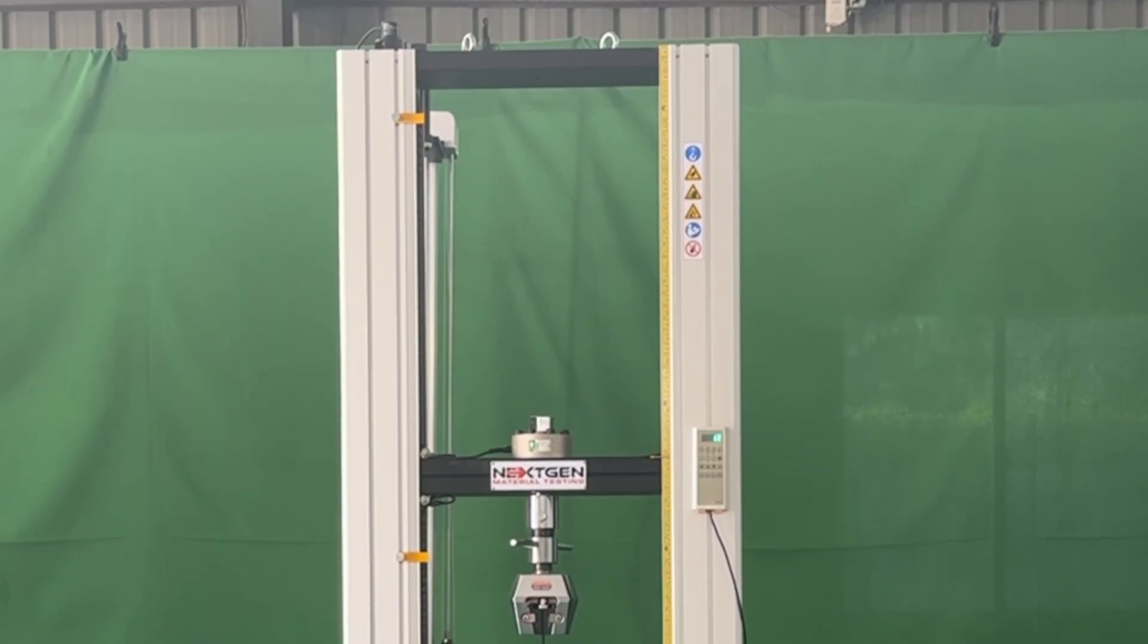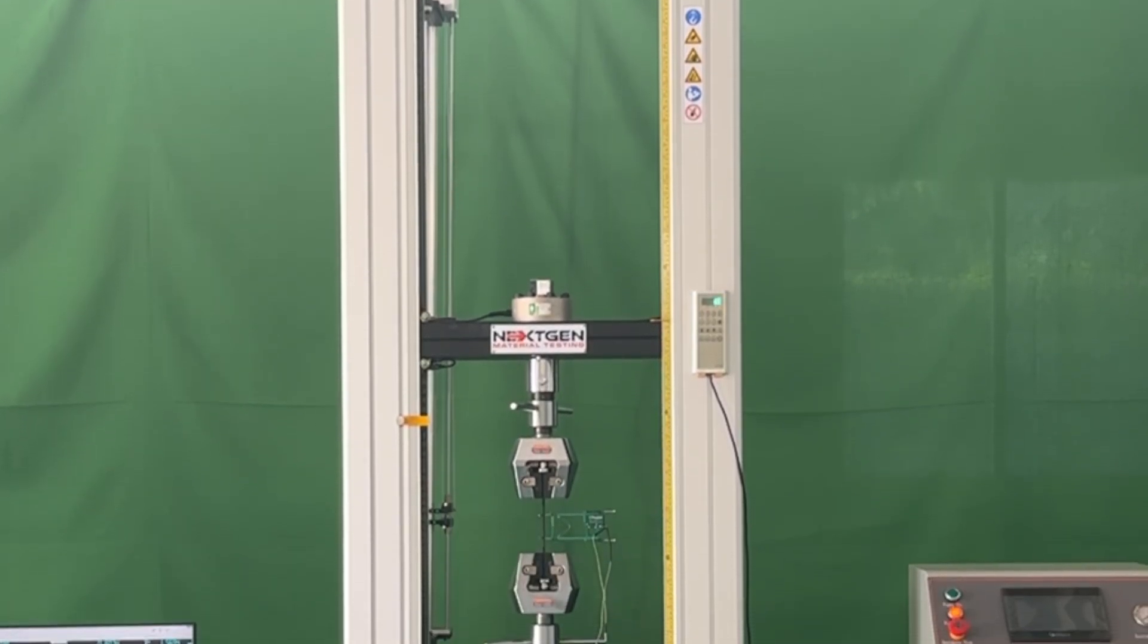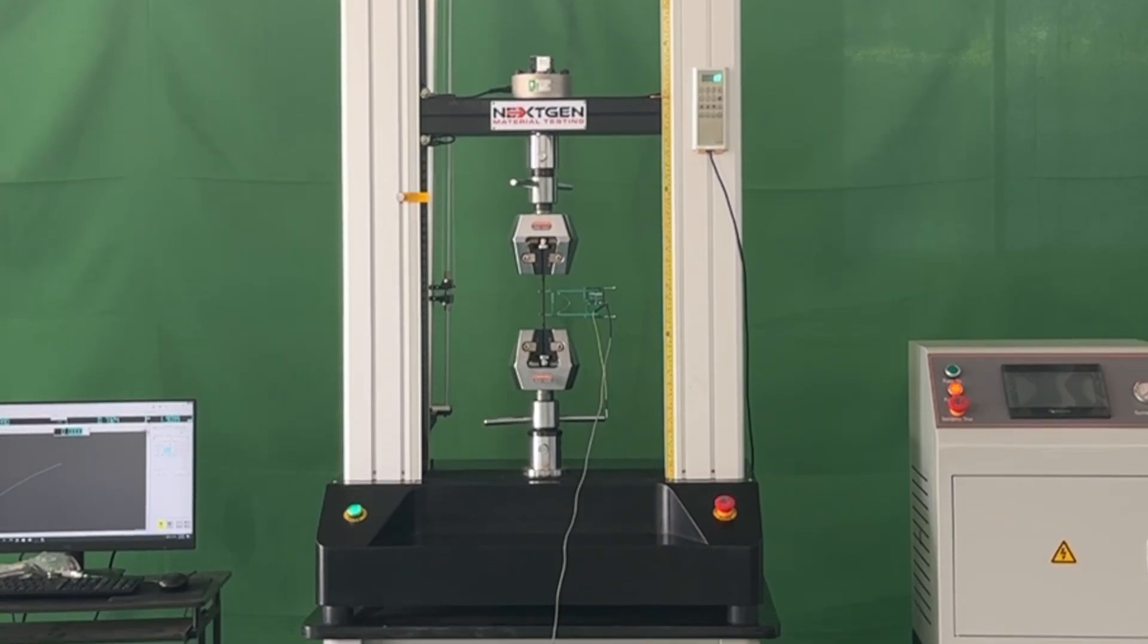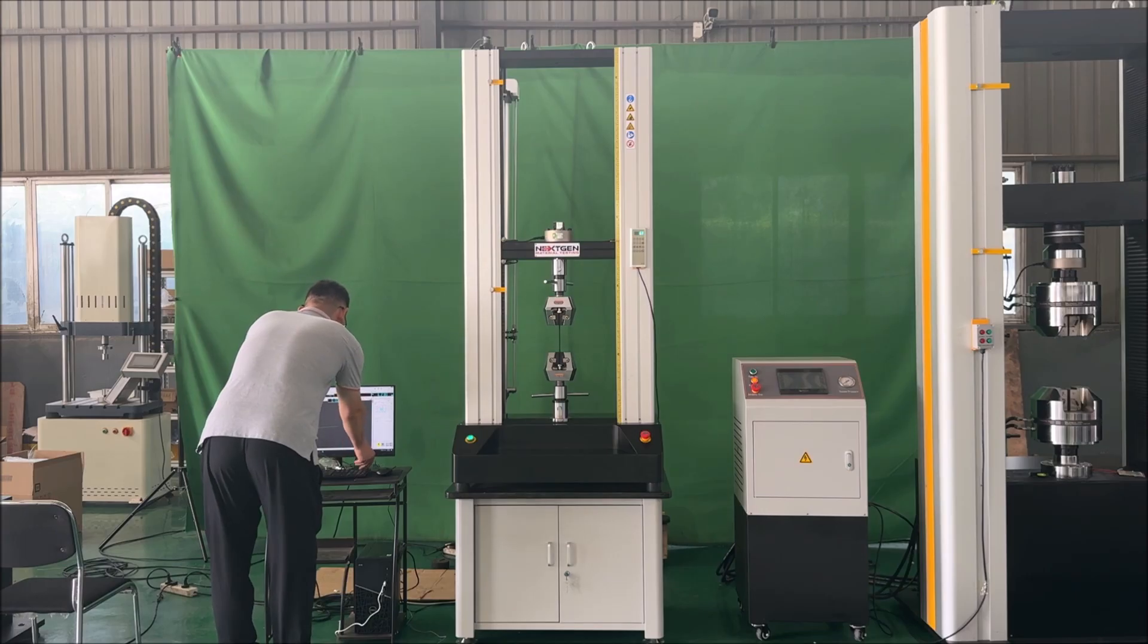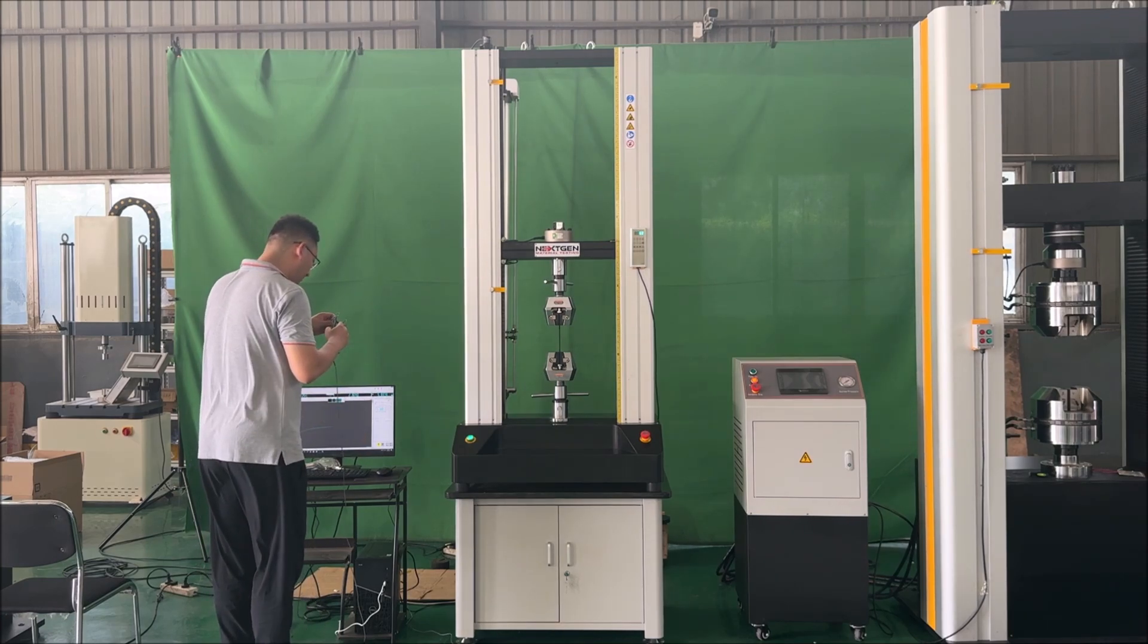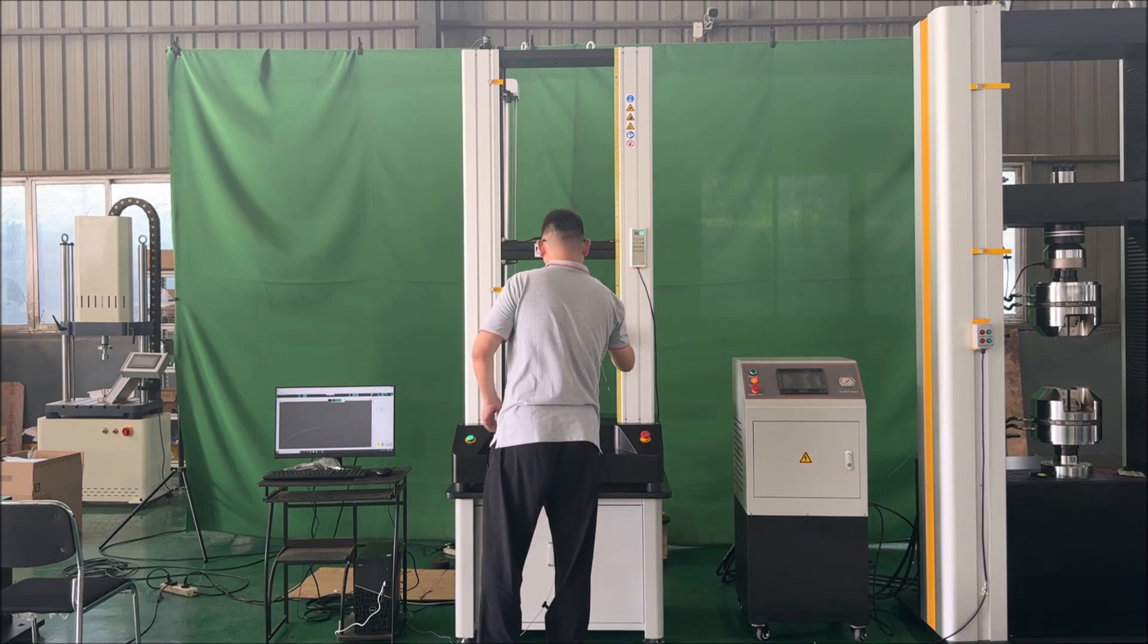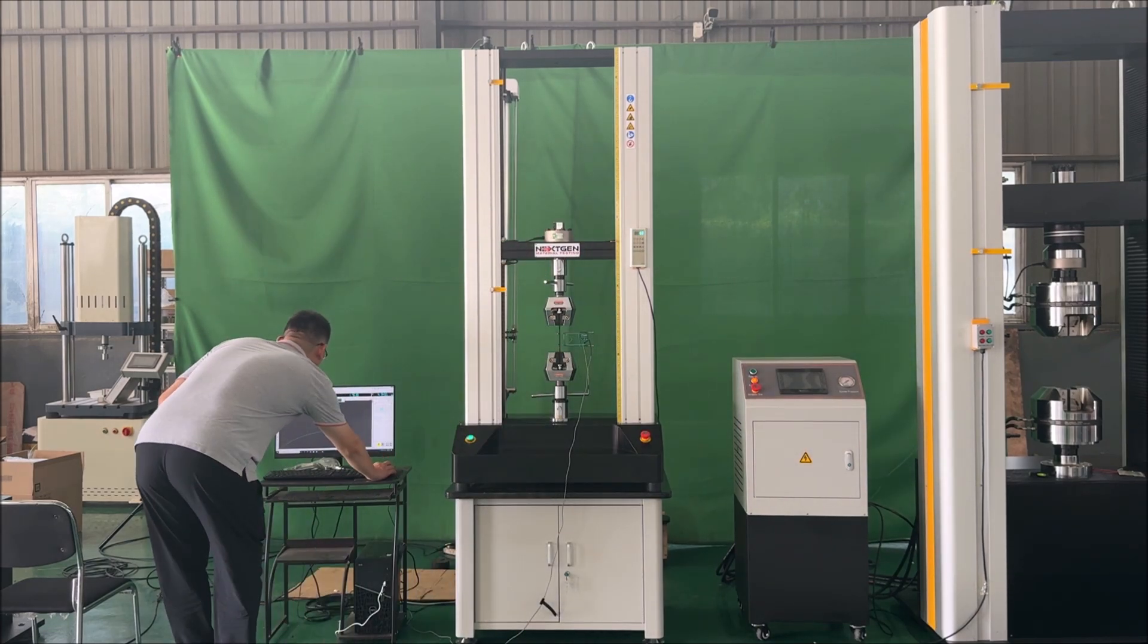Introducing the 50 kilonewton universal testing machine in action. This video showcases a tensile test using self-tightening eccentric roller tensile grips designed to meet the ASTM D638 standard for testing plastic materials. Watch as the system delivers precision and reliability during testing.